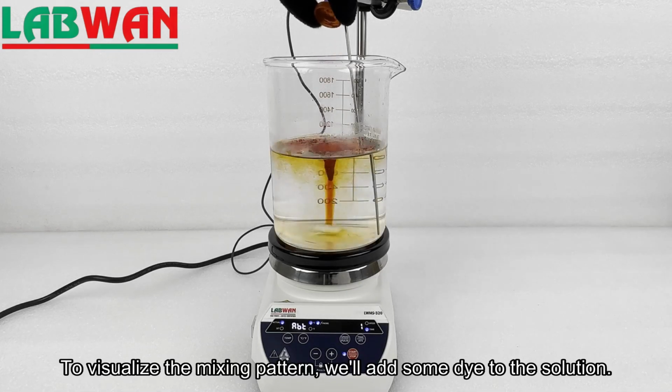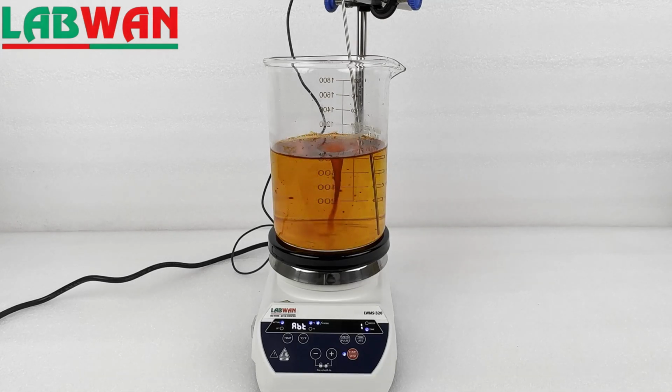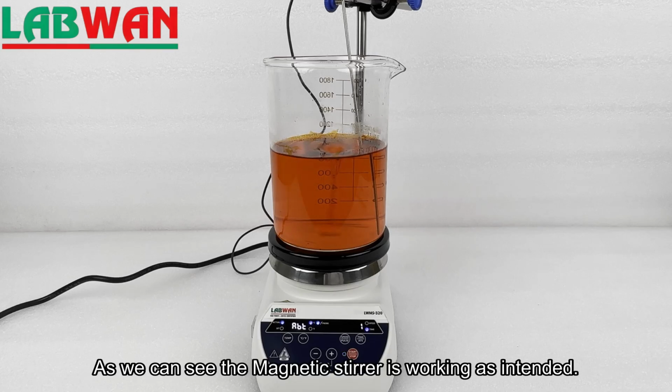To visualize the mixing pattern, we'll add some dye to the solution. As we can see, the magnetic stirrer is working as intended.